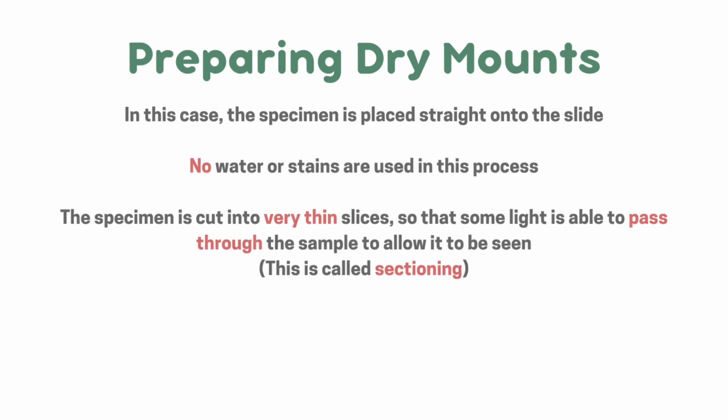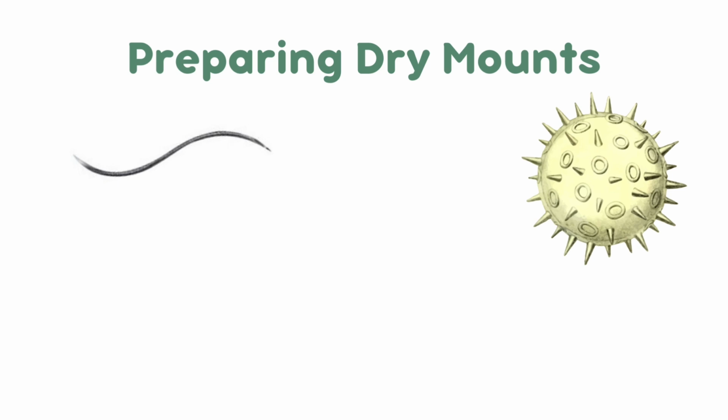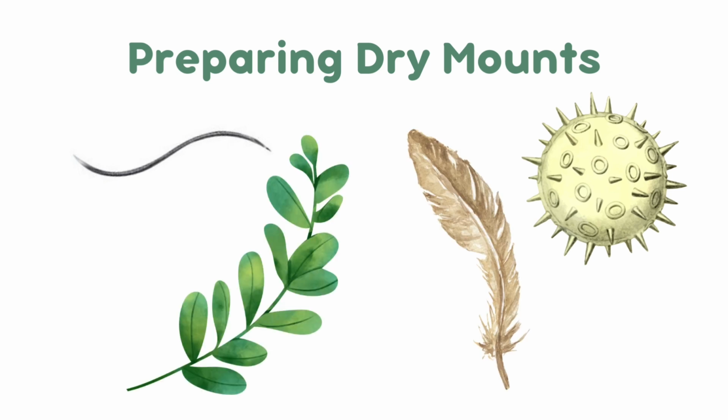The specimen is cut into very thin slices so that some light is able to pass through the sample to allow it to be seen. This is called sectioning. A cover slip is added to the slide above the specimen. Samples such as hair, pollen, feathers, or plant material can be studied with dry mounting. And here's how you do it.